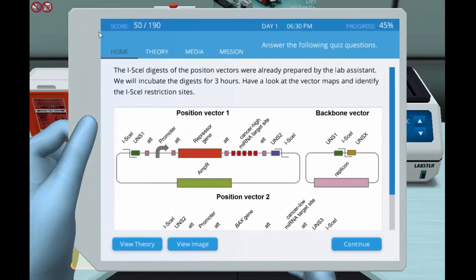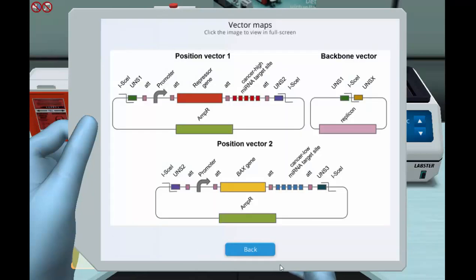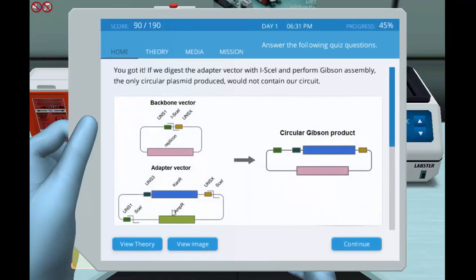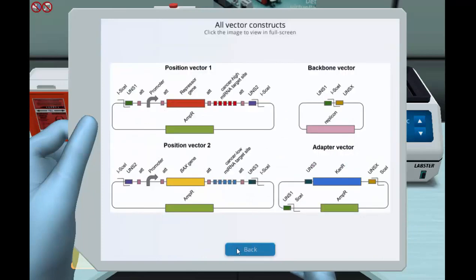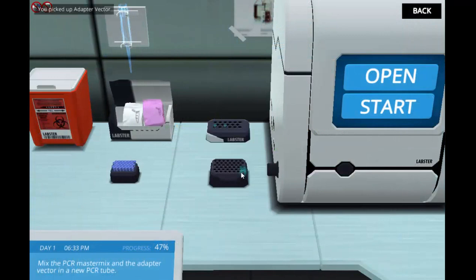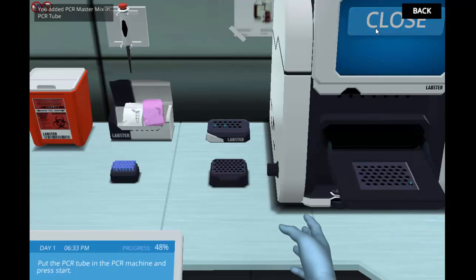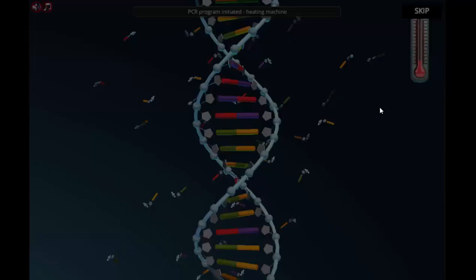Students will learn how unique nucleotide sequences in the position vectors can be used to assemble large biological circuits. They will identify the right sequences to produce the required circular plasmid. Students will also learn how to use the PCR technique to produce an additional DNA fragment that is needed for the Gibson assembly of the full circuit.